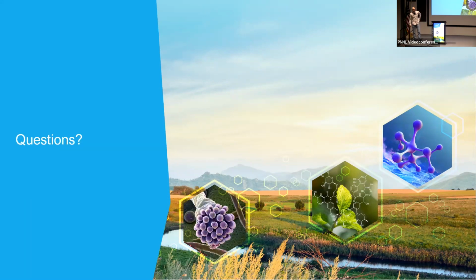I was wondering if this technique can also ionize metal-based organic compounds, whether it's easier than just organic-based compounds. And second question is whether mineral-organic interfaces can be visualized and characterized too. I think you will hear that better in the SIMS talk later this week for the elemental analysis.